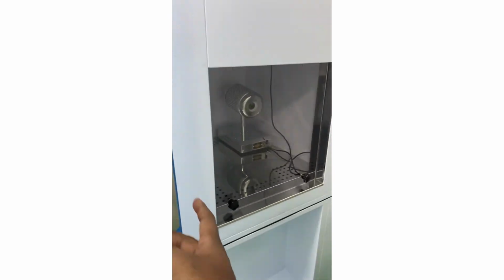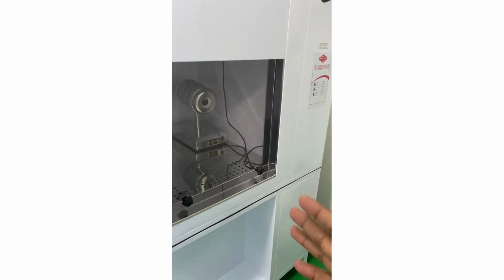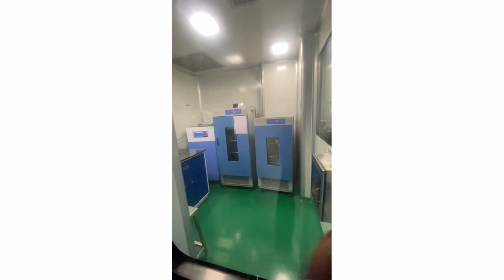This is the biosafety cabinet, advanced equipment. Here we are testing only pathogenic organisms like Salmonella and coliform. We are identifying and testing whether anything is present in that product. This is the final incubation room. We have incubators separately.